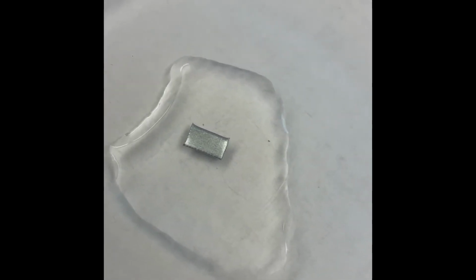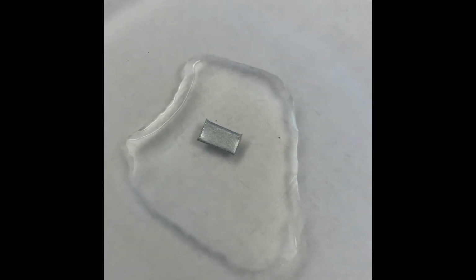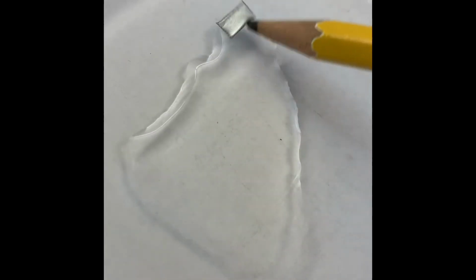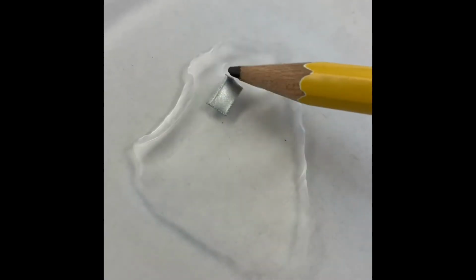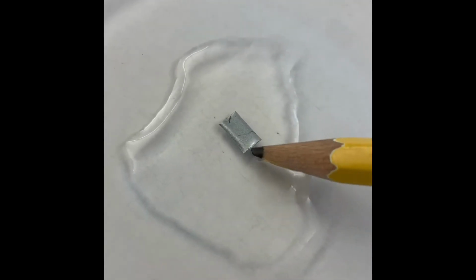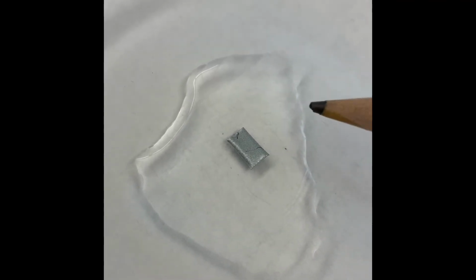At first glance, it doesn't look like much is going on. Maybe a little bit of discoloration, although that might just be a shadow. Let's see if we can... There we go, flip it over. There we go. Yeah, aside from just marking it up with my pencil, nothing's really happening.